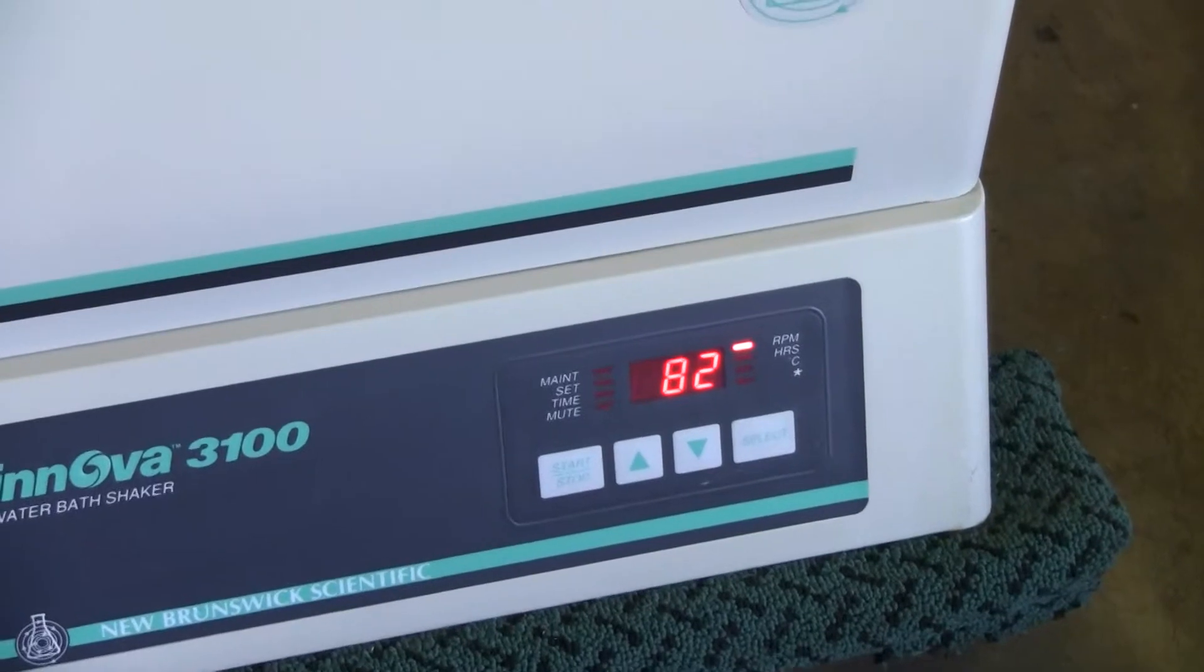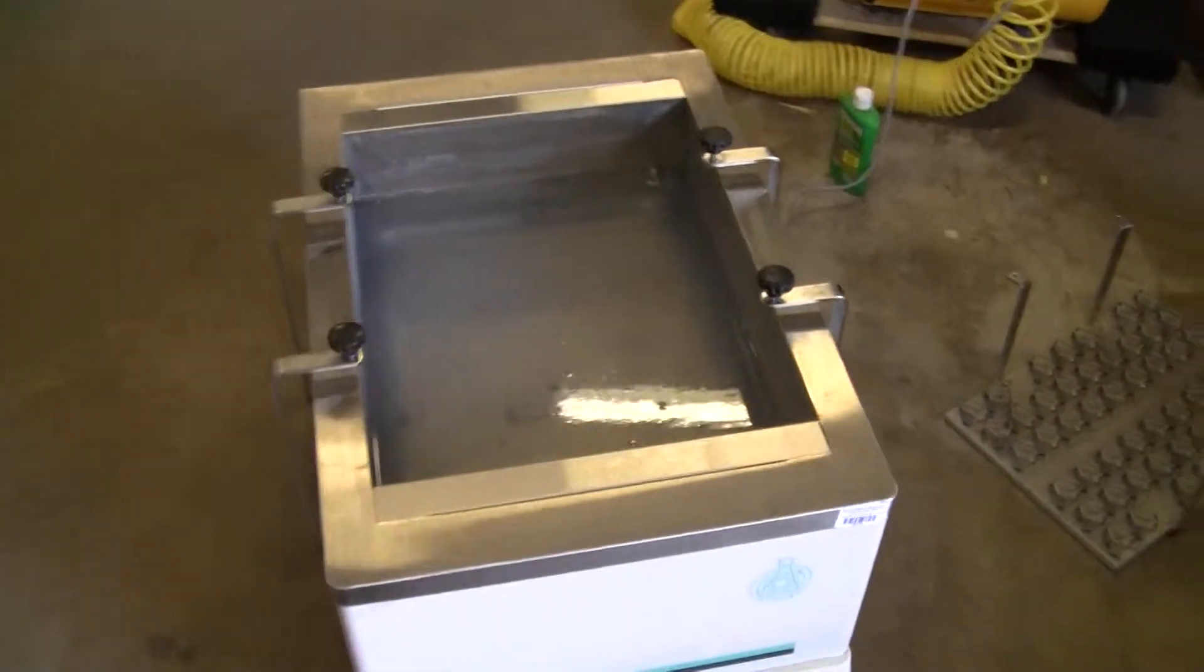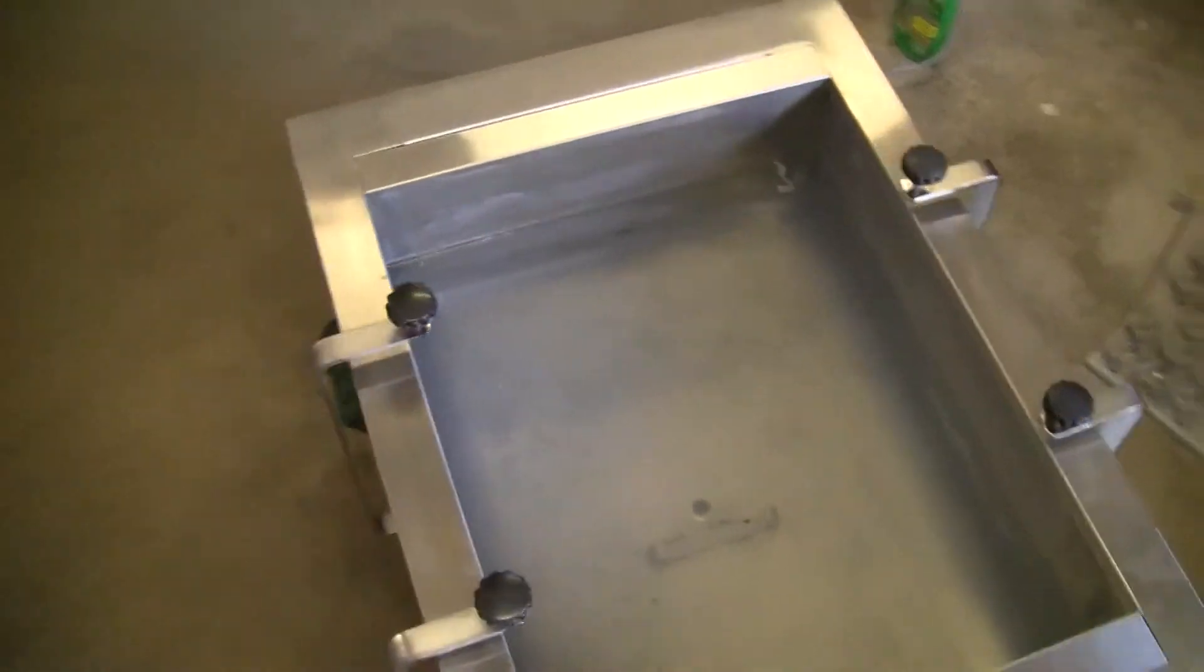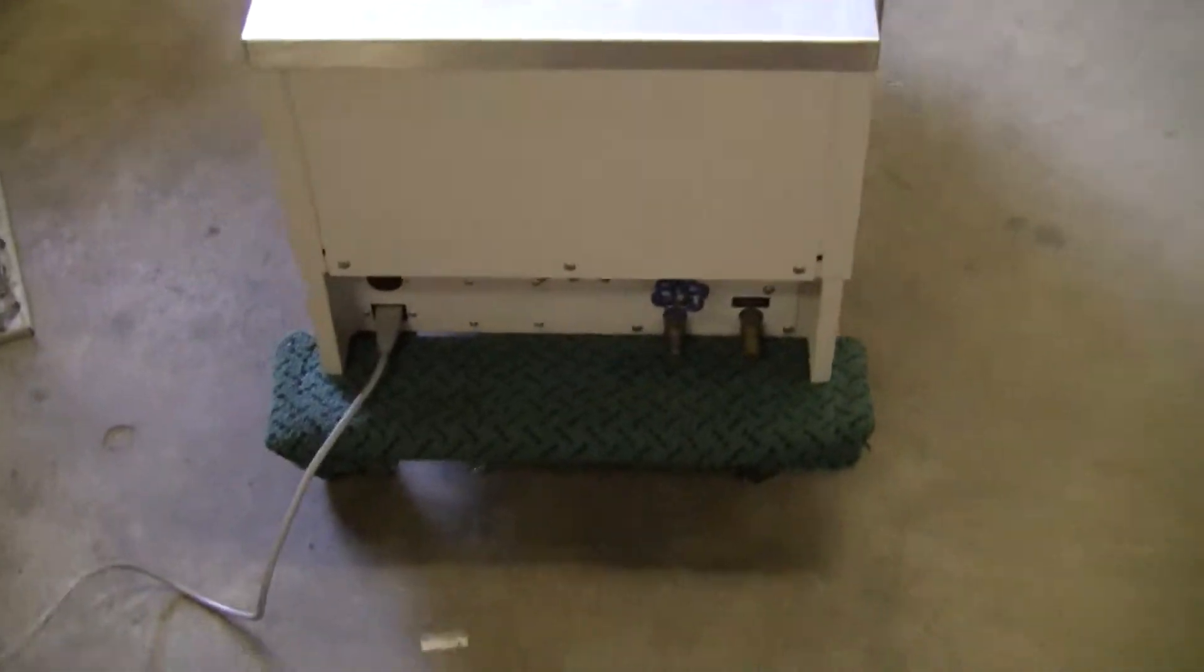You can see the RPMs climbing to a set point. This is a water bath. Here's the rear of the unit.